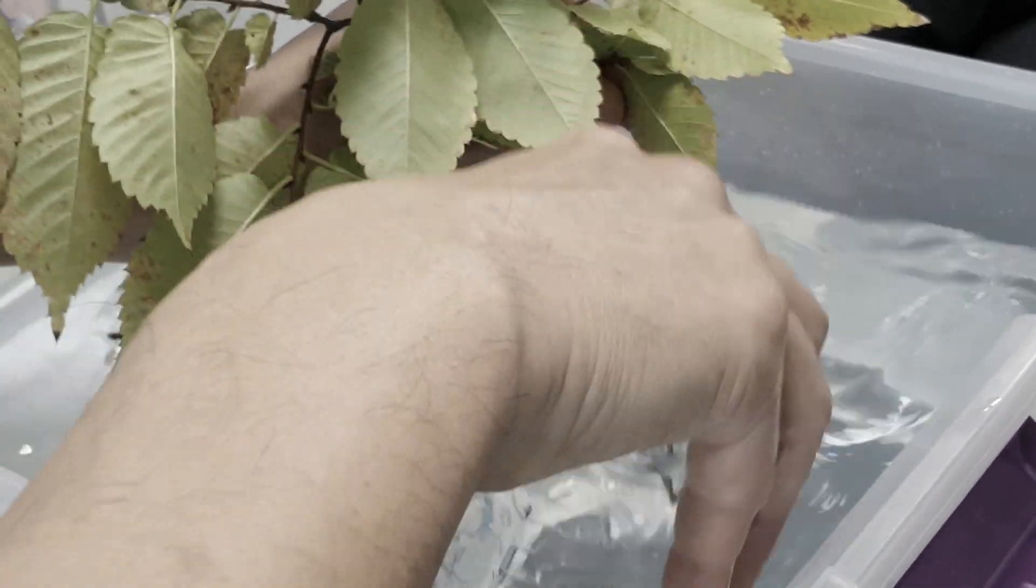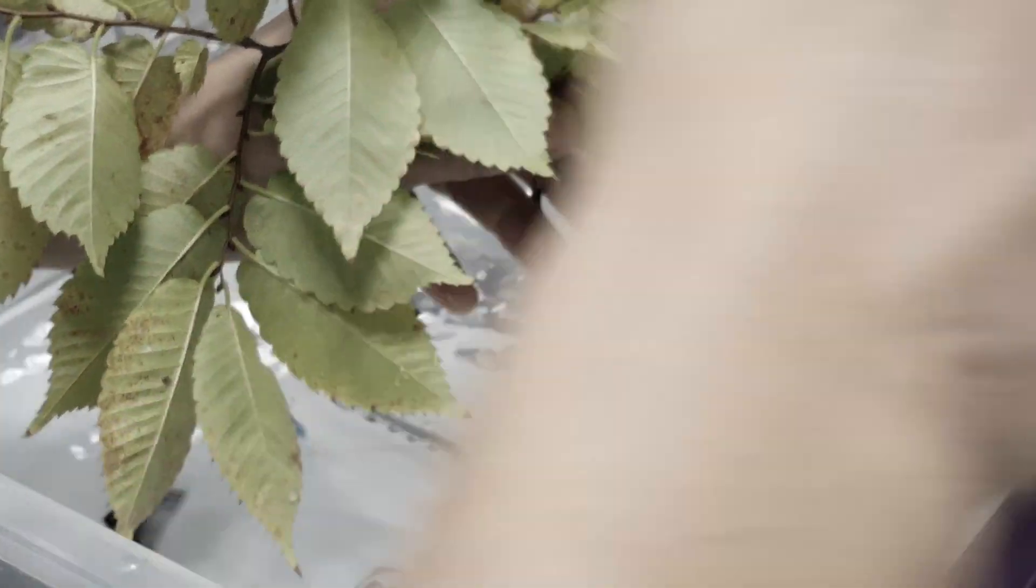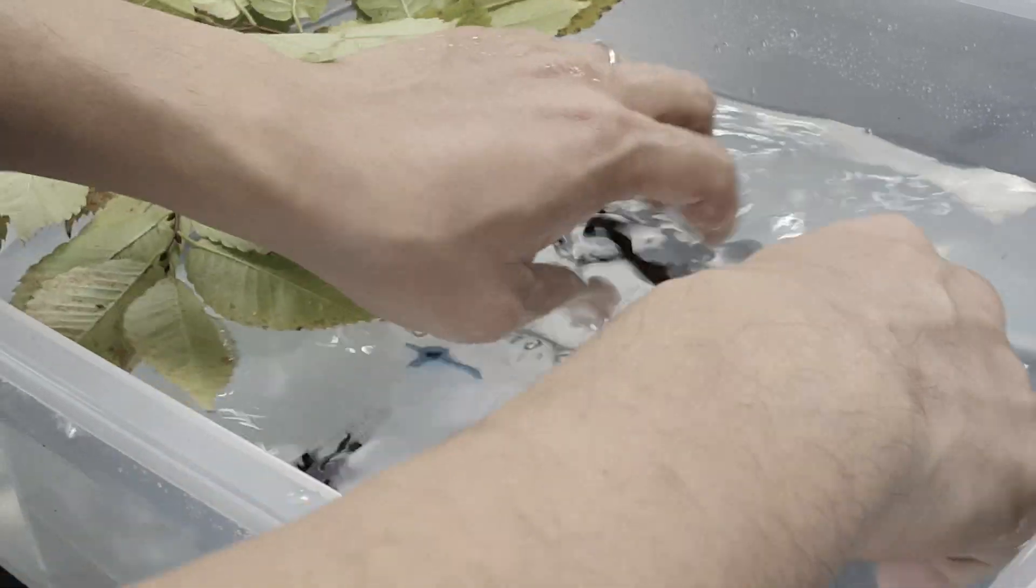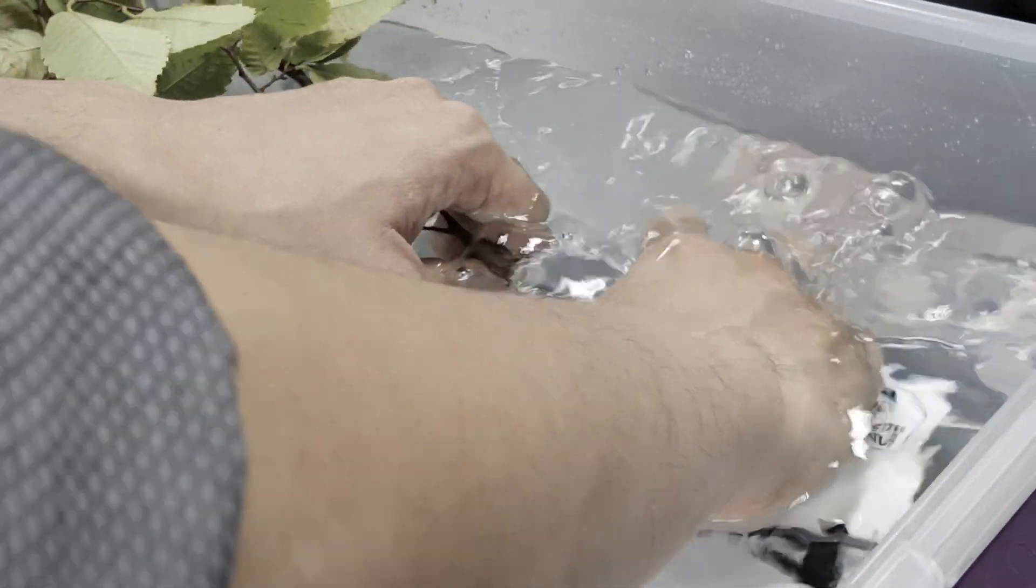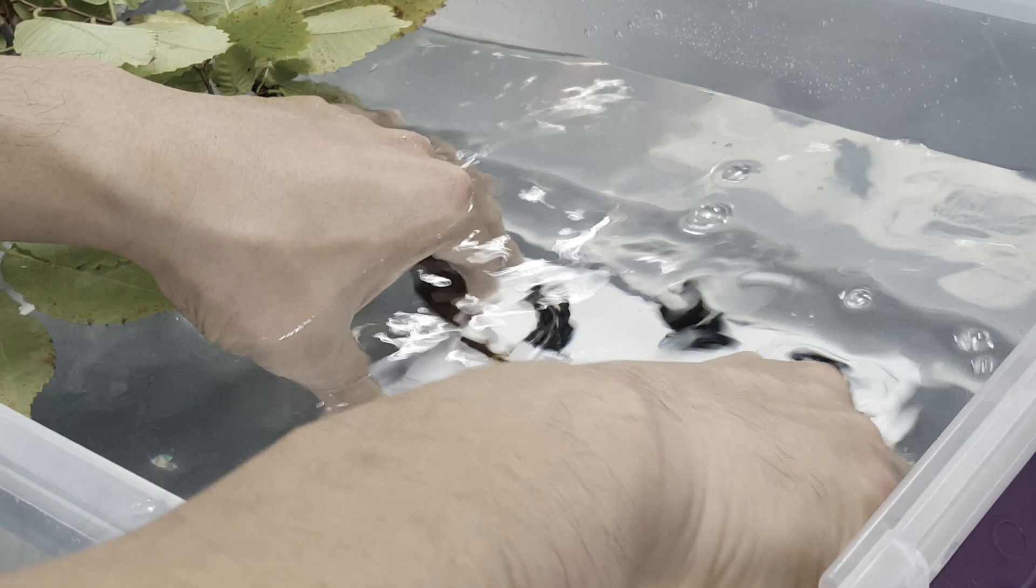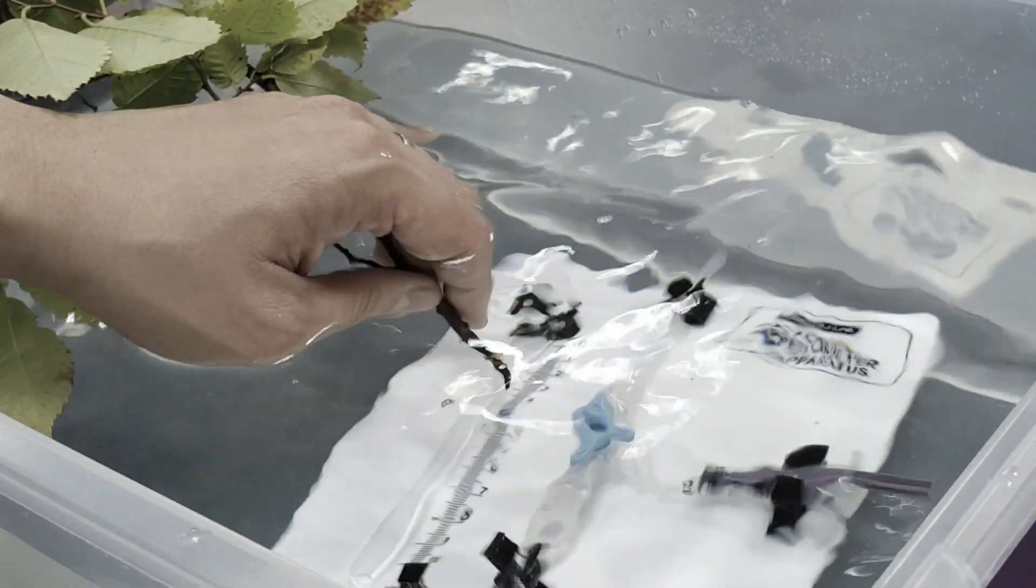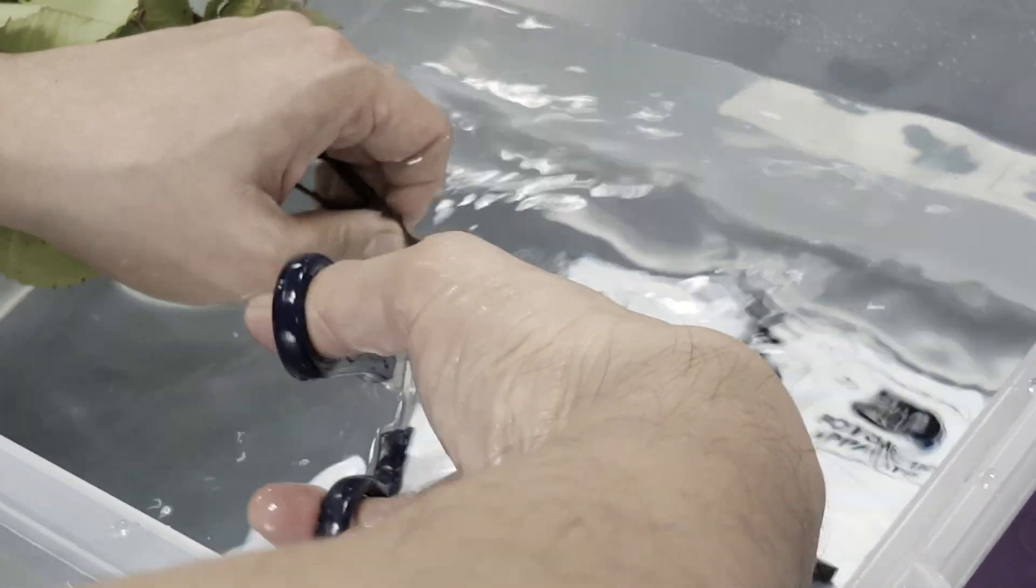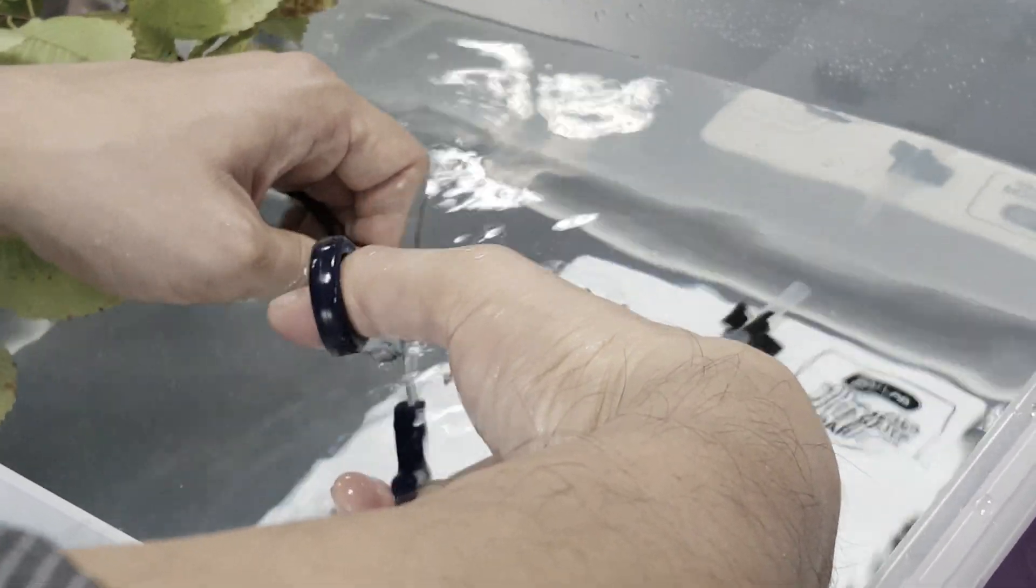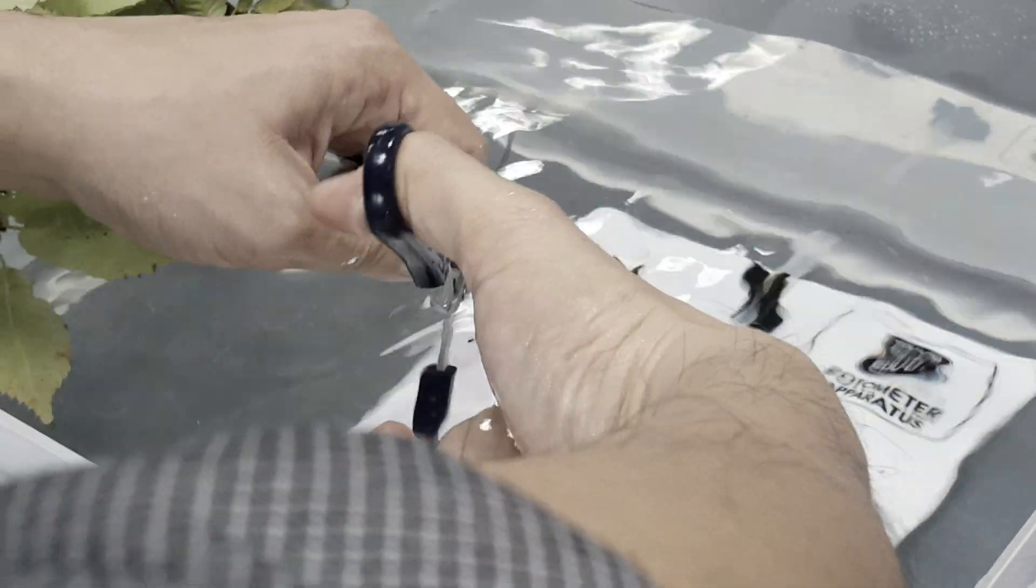You cut the stem—regardless of the size, you cut a little bit of it underwater. You'll start to notice that Mr. Chang's experiments will use a lot of water. So you cut it underwater.